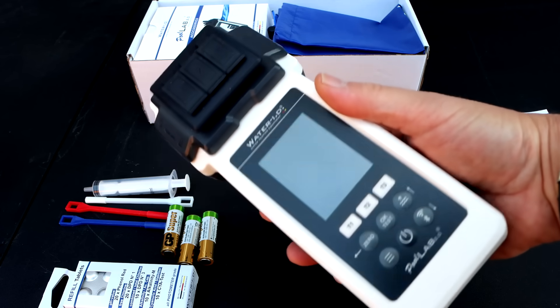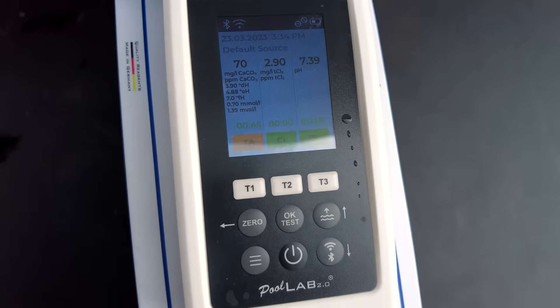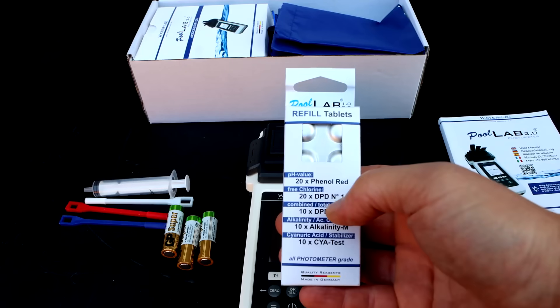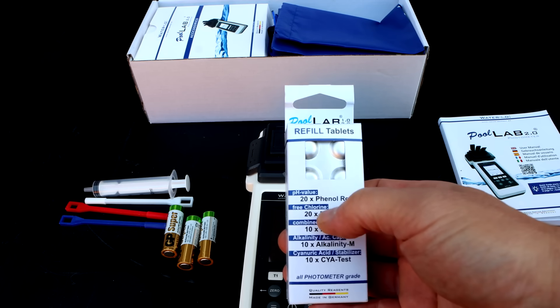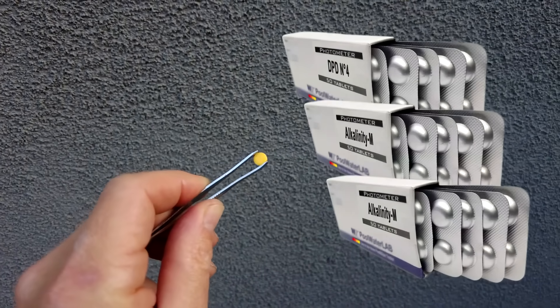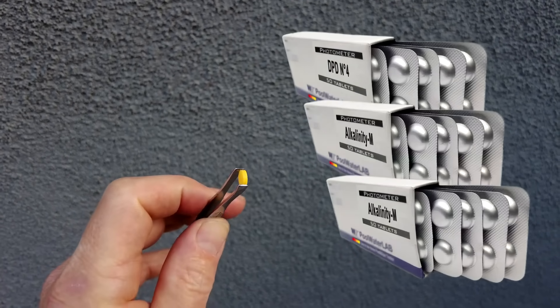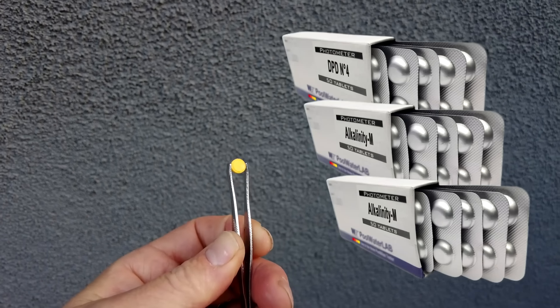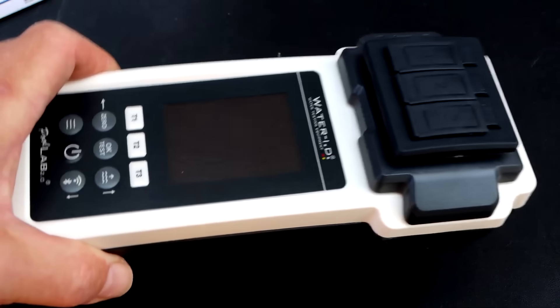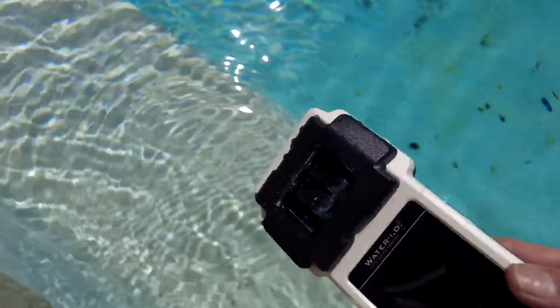At the time of this recording, this photometer can do 24 different test factors. Probably the best and most unique feature is that you can do three test factors at the same time. The included tablets test for pH, free chlorine, combined chlorine, alkalinity, and cyanuric acid. Most test factors use a tablet with pre-measured reagent, making it one of the most accurate ways to test your pool water. The testing unit is completely waterproof.